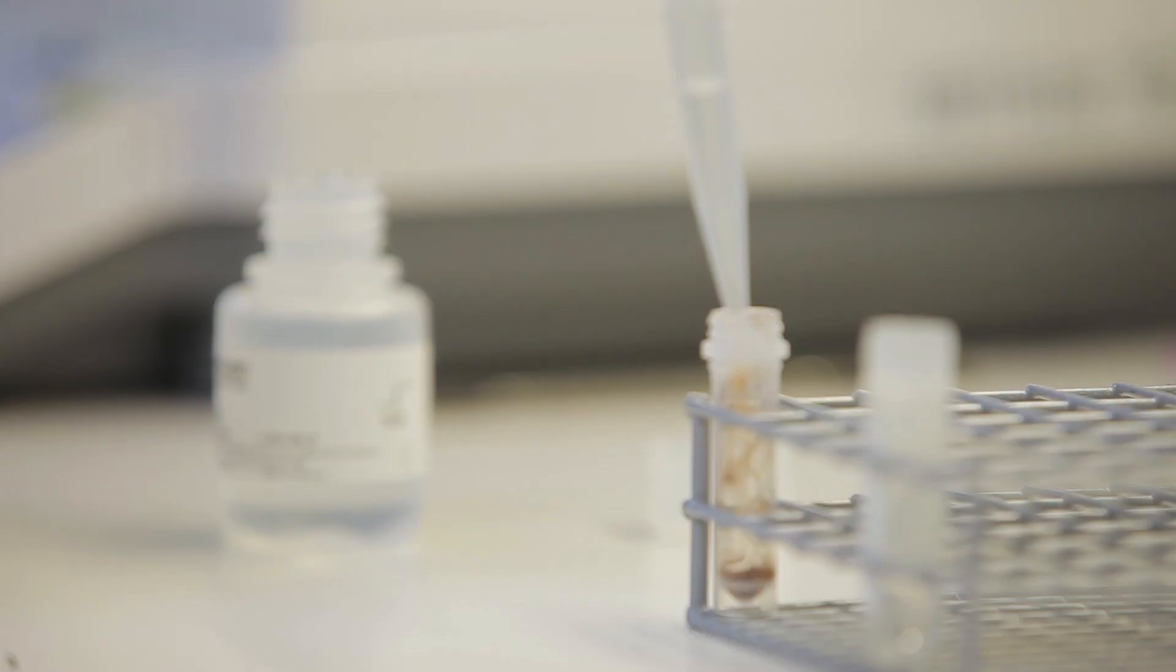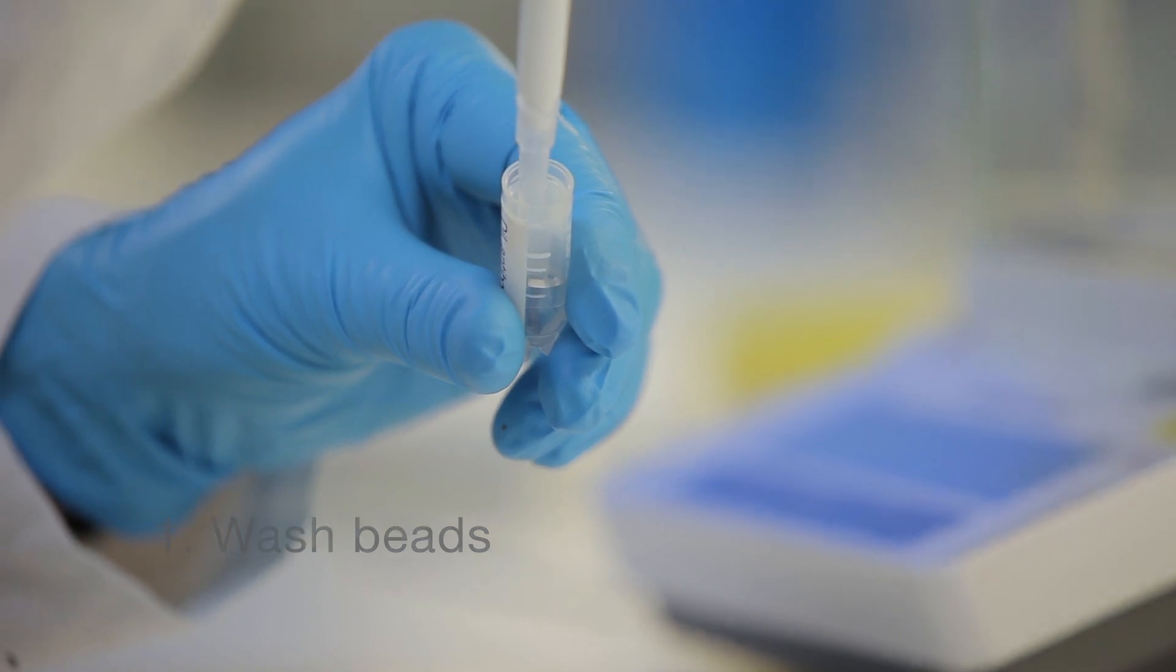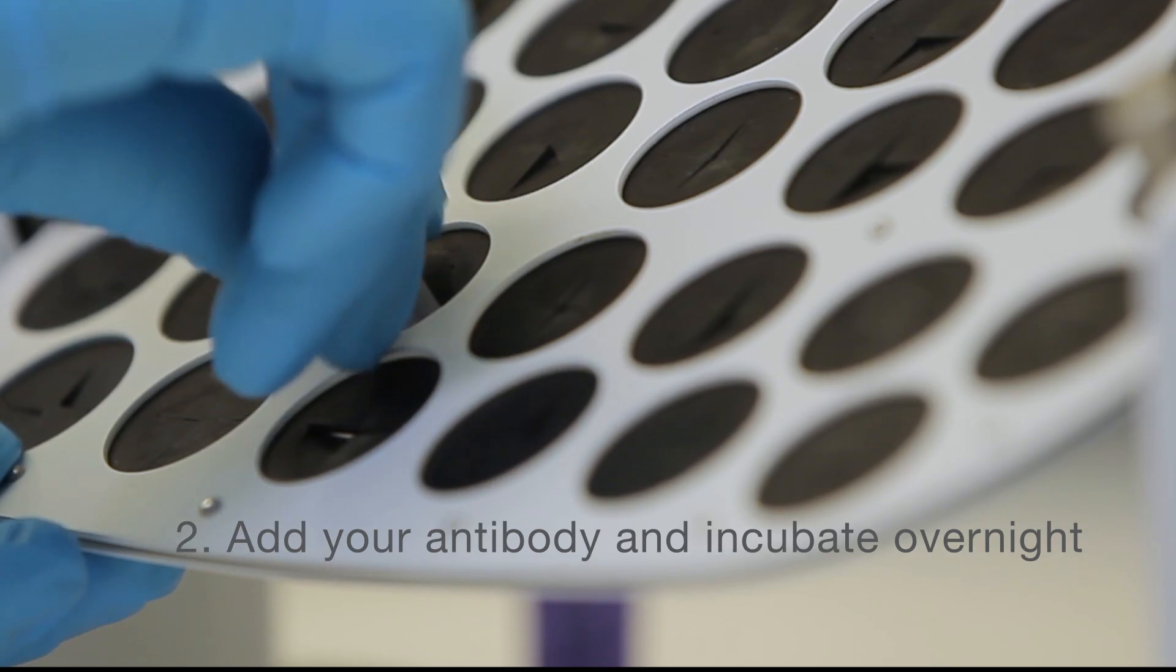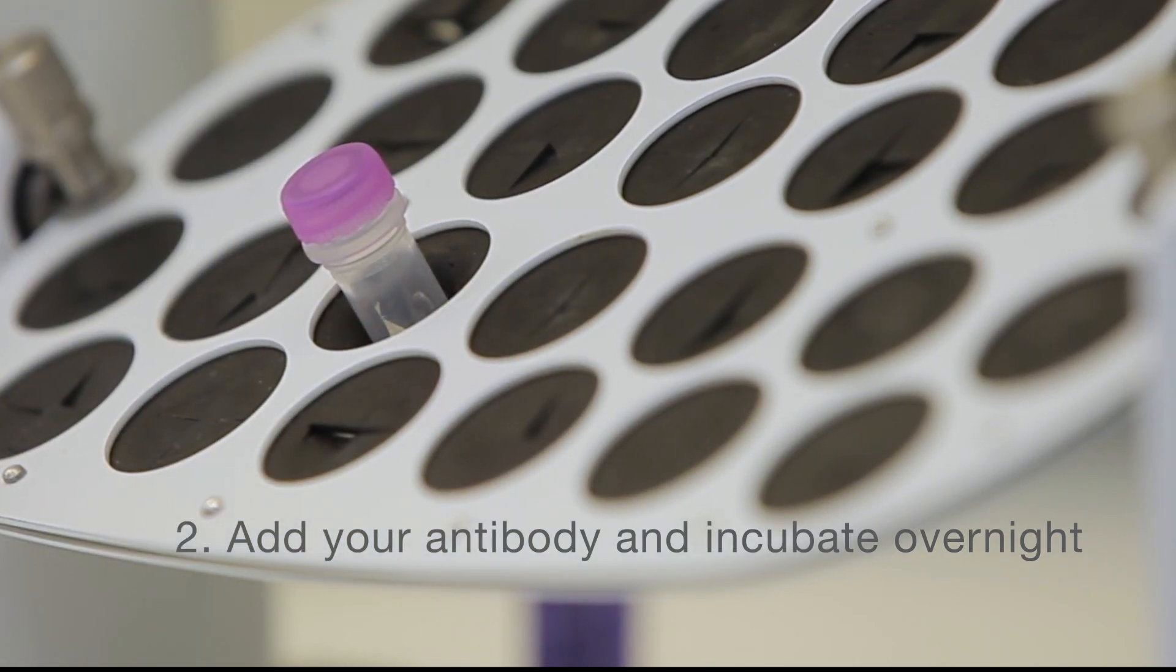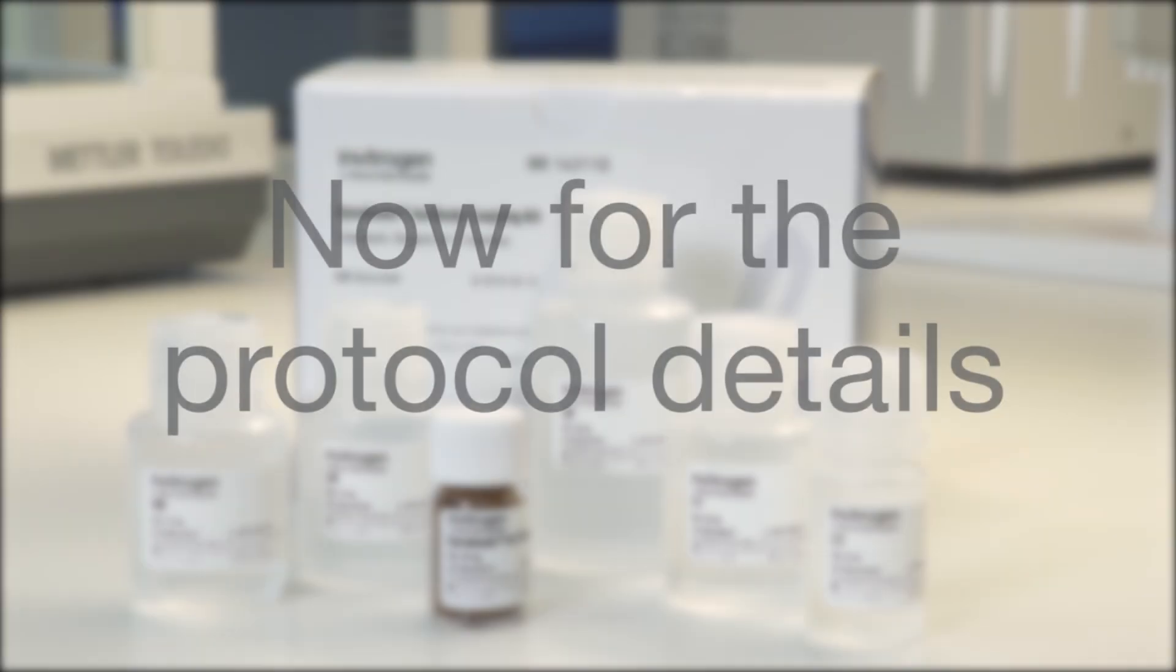The coupling process has only three steps: 1. Wash the beads. 2. Add your antibody and incubate overnight. 3. Wash again and the beads are ready for use.